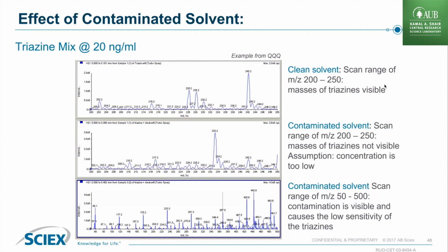And polymer is the #1 contamination because unfortunately polymers are everywhere. Right? They are the main components in soaps. They are the main components in plastics. So if you do see any kind of pattern like that one that we're looking at there, or let's say a very high ions, your solvent is unfortunately contaminated.